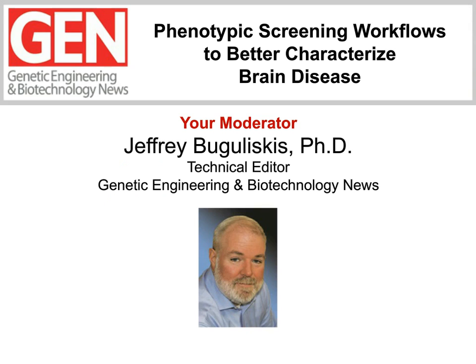High content analysis is becoming increasingly important for the drug discovery process. The development of new phenotypic screening assays and equipment that can generate significant amounts of high-quality imaging data affords investigators the ability to follow individual biomolecules within cells, allowing them to observe their effect on metabolic pathways and cellular structure. Many organizations have put significant time and effort into developing high-content imaging platforms that provide researchers the ability to not only quantify the information contained in the images, but also to provide solutions for data management and data analysis following image processing.